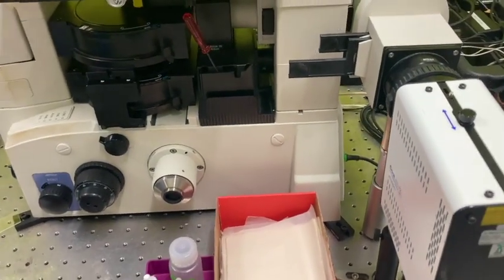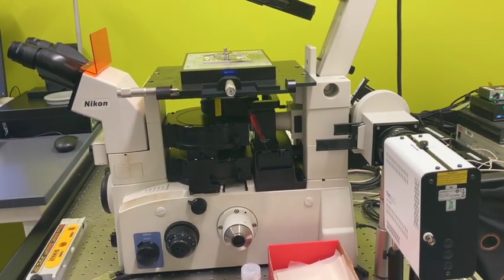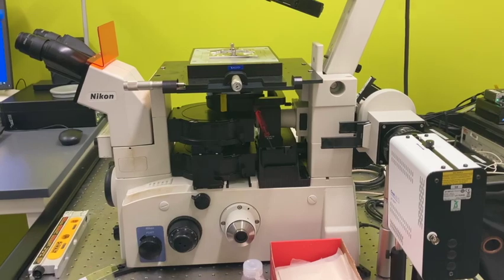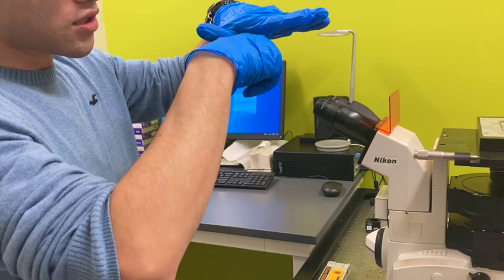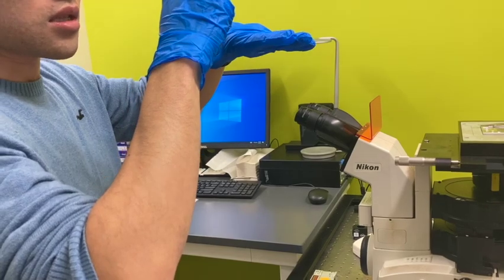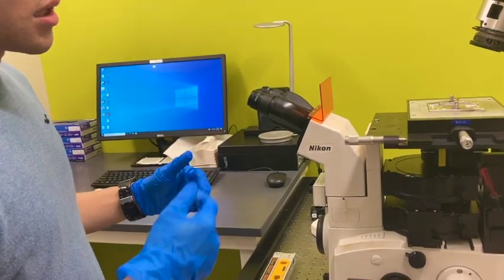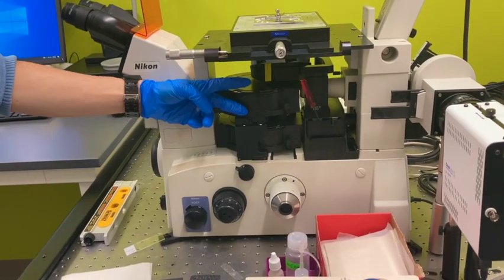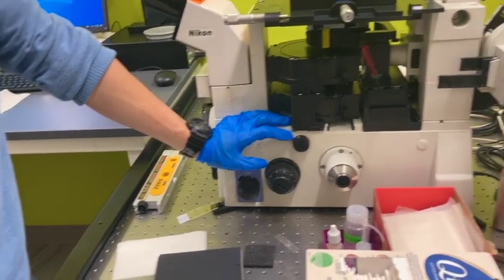By epi illumination, it means light is going through our sample, and by TIRF, it's going in at an angle and then reflects, total internal reflection, and only a very limited amount of energy is going into that penetration depth, and that's where we excite our probe. That's why we have very high contrast. But yeah, the difference is the epi on the top and the TIRF on the bottom.